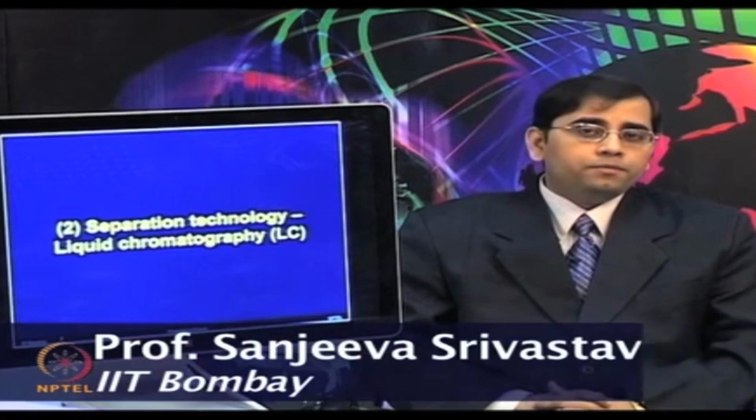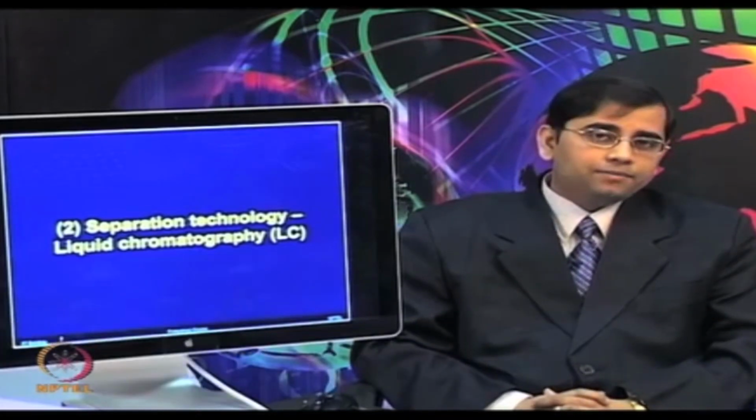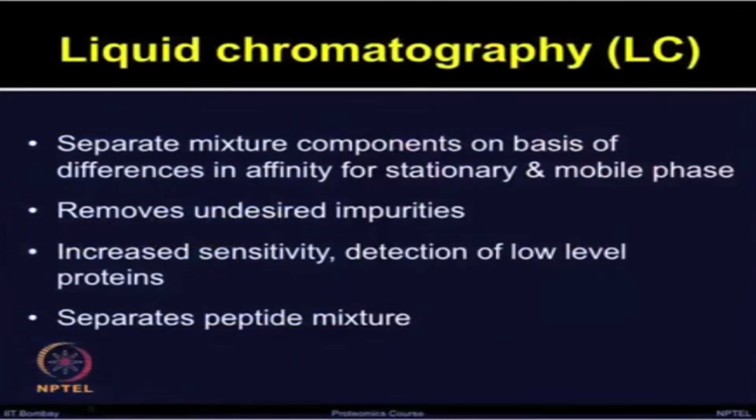Now, depending upon the mobile phase, the technique is termed as either liquid chromatography or gas chromatography, etc. So, what is liquid chromatography? The peptide mixtures can be fractionated in line with the instrument prior to the introduction into the mass spectrometer. That is, I think, one of the advantages for doing proteomic applications.